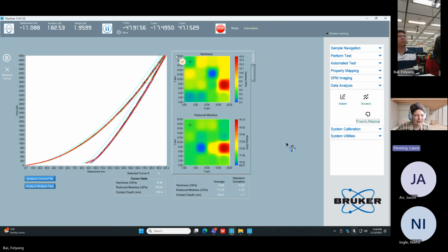Thank you. That being said, for the .hys files for an individual indent, I'm sure there'd be a way to figure out how to do that in the post analysis if you're clever with coding between the data that's in each .hys file, if you wanted to do it for an automated result. We'll work on it and send it back to you. Okay, sounds good.